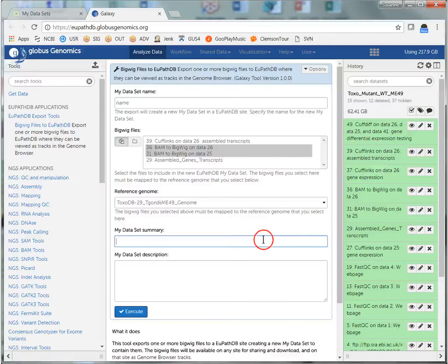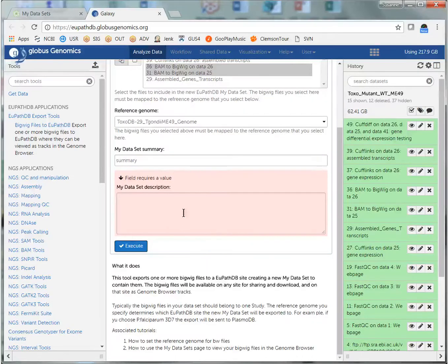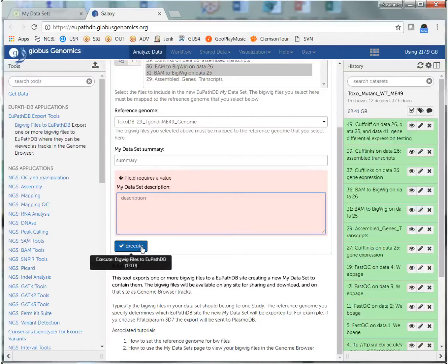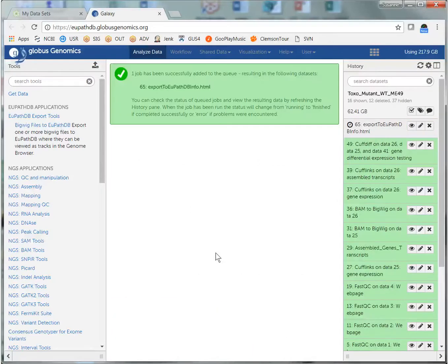You also have to have a summary and a dataset description. If you don't fill these in, you will be prompted to do so. So I have all the fields filled in. I'm going to click Execute.